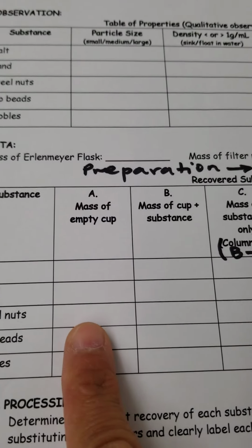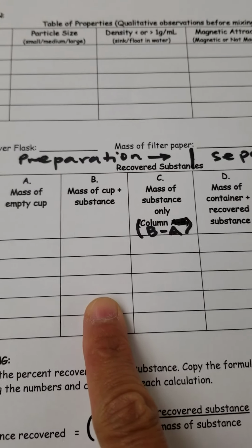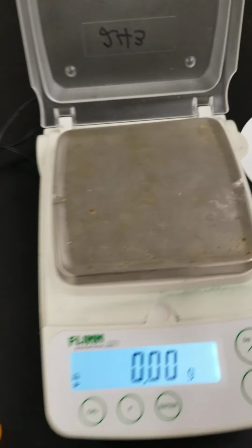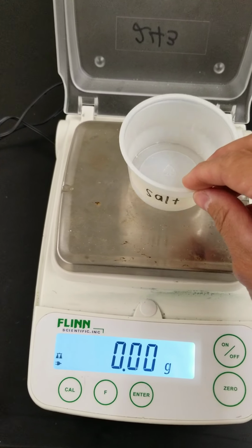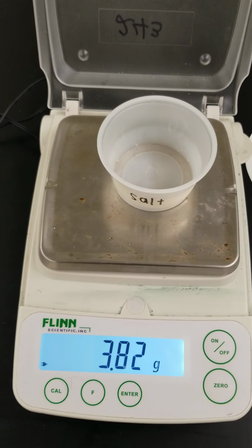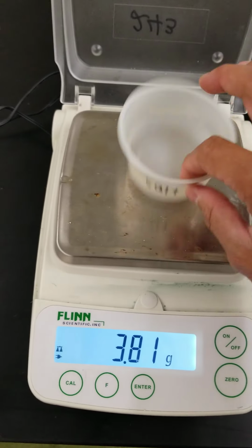So to help you out, I'm going to measure the mass of the empty cups, and then I will add each of the substances and measure the mass of the cup for each substance. So first, let me compile all of our cups together. Okay, so hold on to this. Here is, so it's zeroed. Salt, just the empty cup for our salt is 3.81.